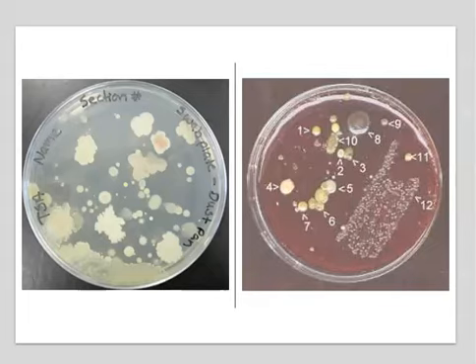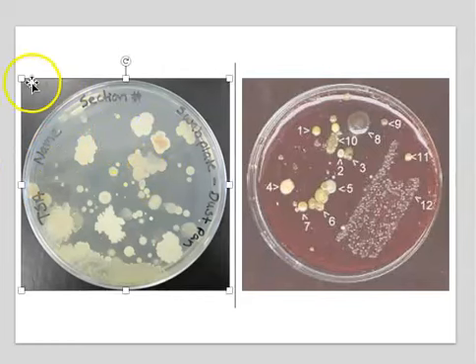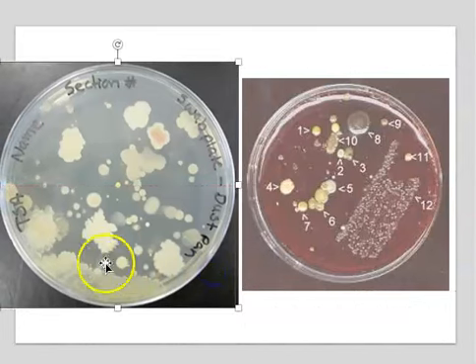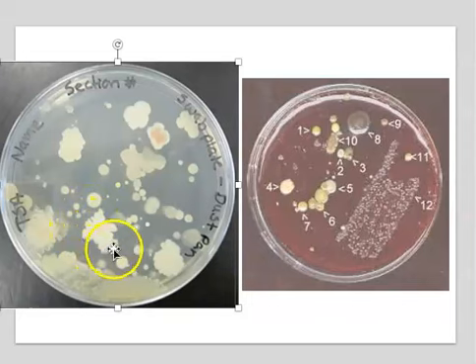Here's a couple other plates taken from the environment. Look at the array of organisms that you can grow. Look at that amazingly large and irregular looking colony growing on this plate. Very interesting morphology there. And then we've got something that looks much more boring, just a circular colony, maybe 2 millimeters across in diameter.